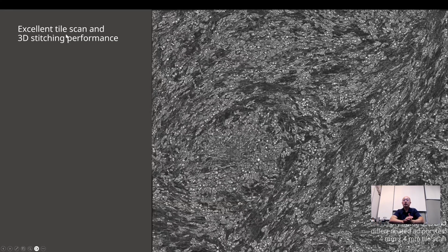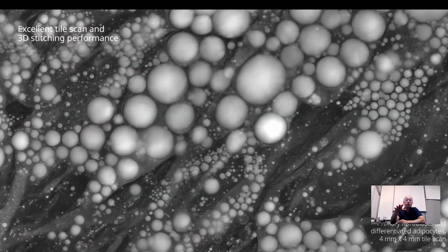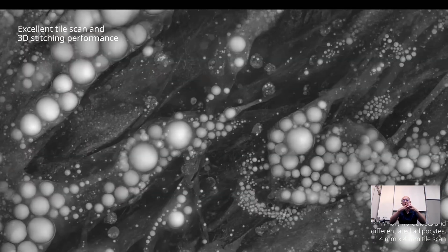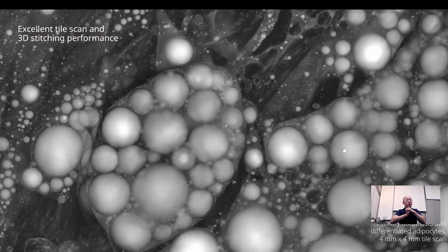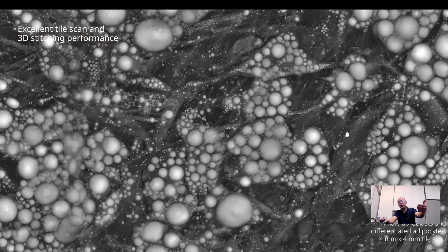And then at day 42, we were also able to measure a large field of view, about 4 millimeters by 4 millimeters. It's again 3D, but since our monitor is 2D, we only visualize the middle section. Nonetheless, you can see the individual lipid droplet structures inside the cell. If you have small lipid droplets, that is called brown fat, and if you have big lipid droplets, that is called white fat. You can also see other subcellular organelles such as mitochondria and the nuclear membrane intact in 3D. Like Google Maps, you can just go all the way down and all the way back.